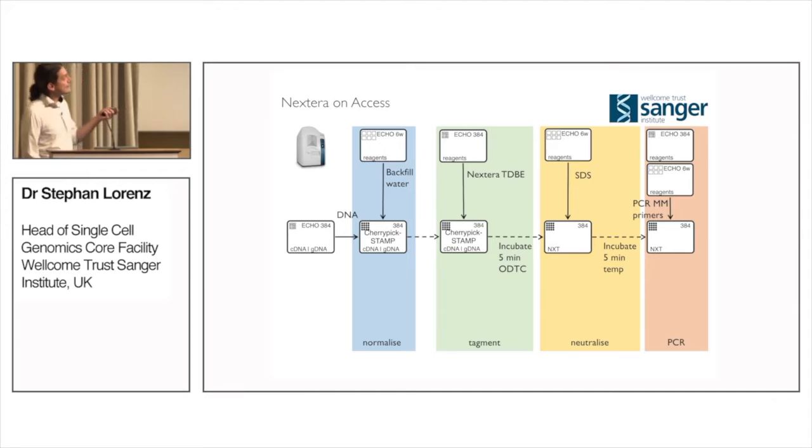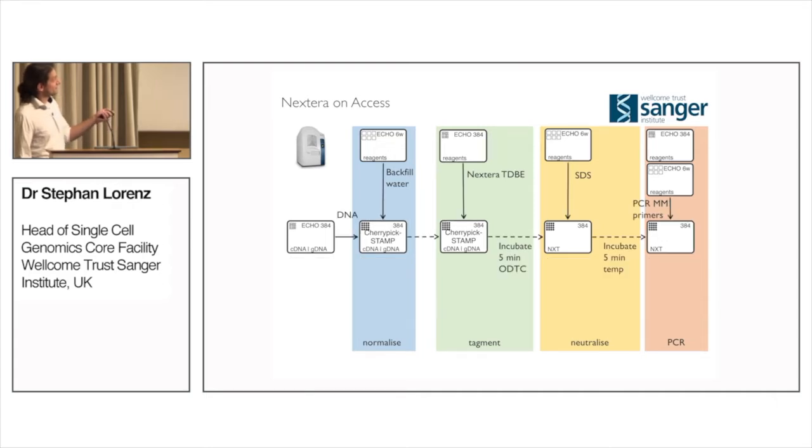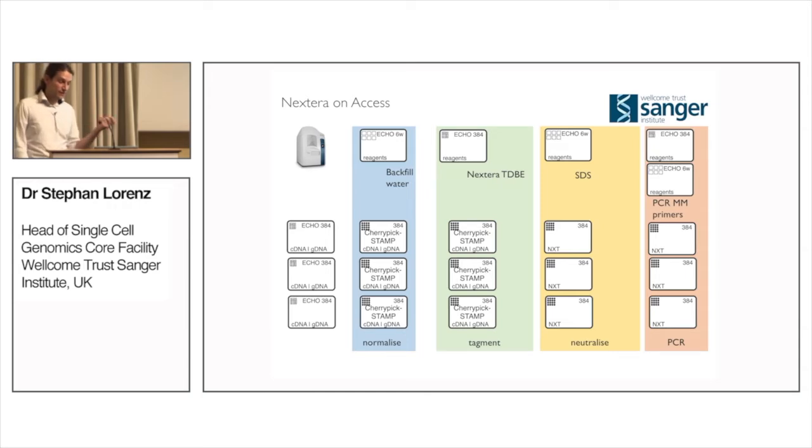Because what happens with the current version of the Tempo software is that it takes all plates through step 1, all plates through step 2, step 3, step 4. So it just replays this, then all of these steps. Which is fine in high content screening applications, but we have time dependencies here. At this stage, the sample is 500 nanoliters. We can't wait for another 7 plates to finish normalization while this is sitting there.